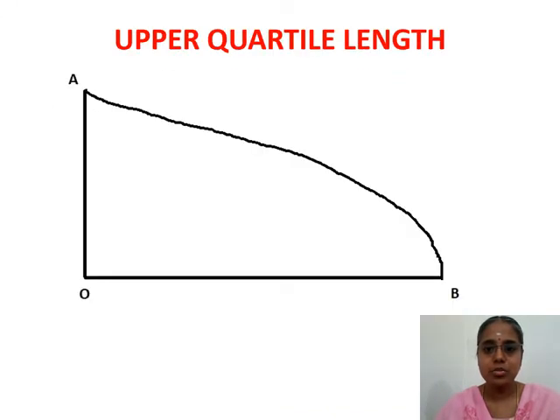Now we'll try to understand upper quartile length. I'm going to play an audio recorded for understanding upper quartile.